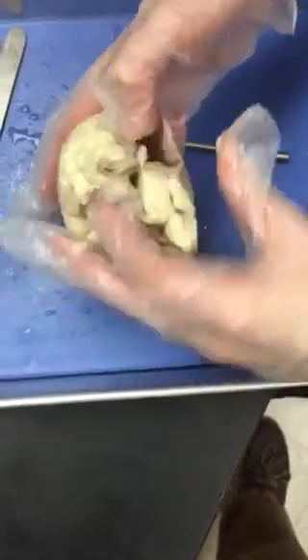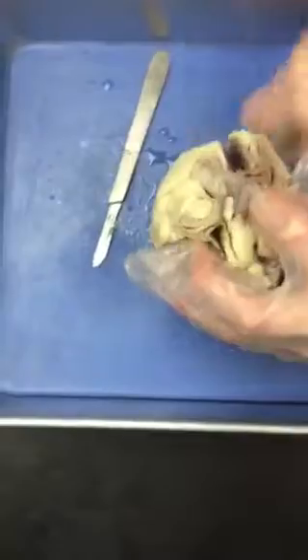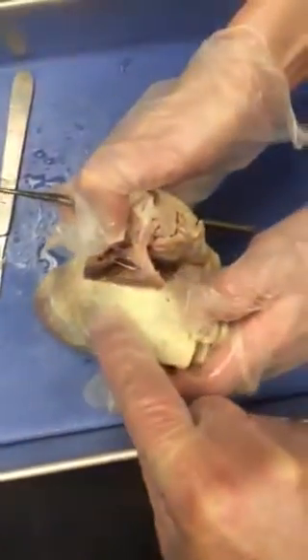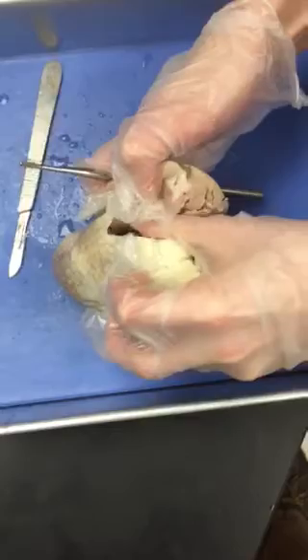Number 30, cut open the superior vena cava and carefully pull back the tissue. You should see thin flaps of tissue that almost look like leaflets. That's what I did. This is the tricuspid valve. Based on the name tricuspid, how many leaflets should you see? 31, feel the leaflets with your finger and describe them in the space below.